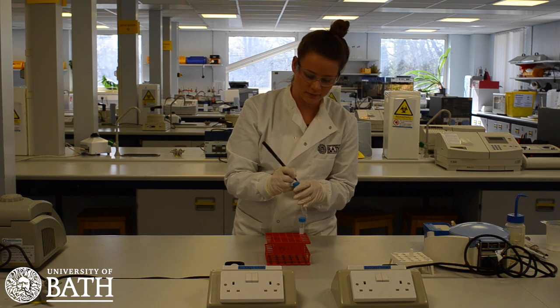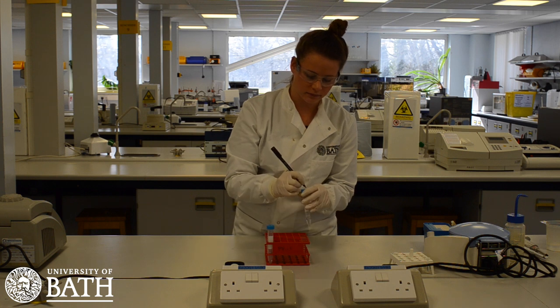Make sure to label these tubes with your initials so that they do not become mixed up with other students in the class and there is no confusion of samples.